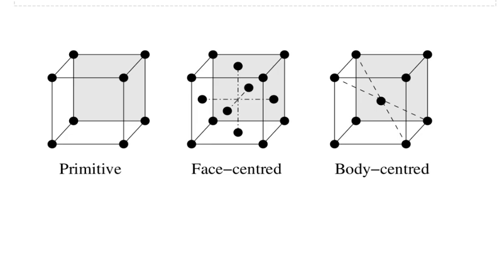But the first thing that the prac addresses is how can we determine how the packing is of atoms in a crystal of the two compounds we're looking at. The two compounds are cesium chloride and lithium chloride, and they could be arranged in a primitive arrangement. So that cesium chloride is in a primitive arrangement. All the atoms are in a perfect cube, simply arranged. With lithium chloride it's slightly different, where you've got atoms of chlorine, for example, at the corners of a cube, and on the faces of the cube your lithium atoms reside.